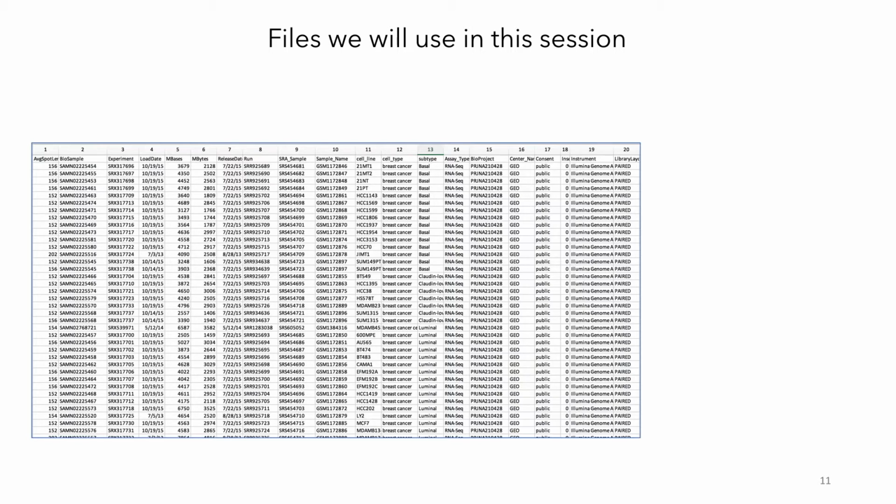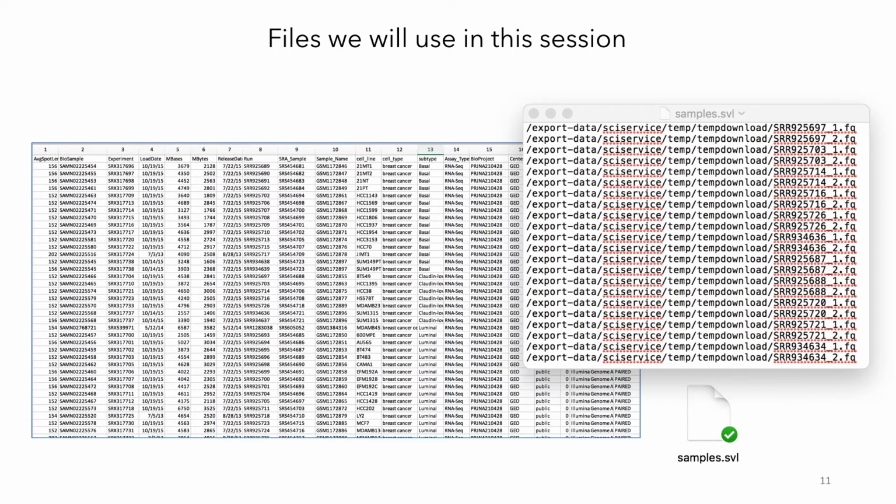Looking at the metadata given with this project, we can see that the data was produced using paired-end sequencing. It is a technique that uses simultaneous reading of each fragment from both ends, thus improving the quality of sequencing. In addition to the file name and its download location, the metadata shows cell line names used in each run and the clinical subtype associated with that sample. To save us some time, we already downloaded and unpacked the archive, preparing it for us to use on the platform. So for our first pipeline, we will select some normal-like and claudin-low samples to do the analysis.